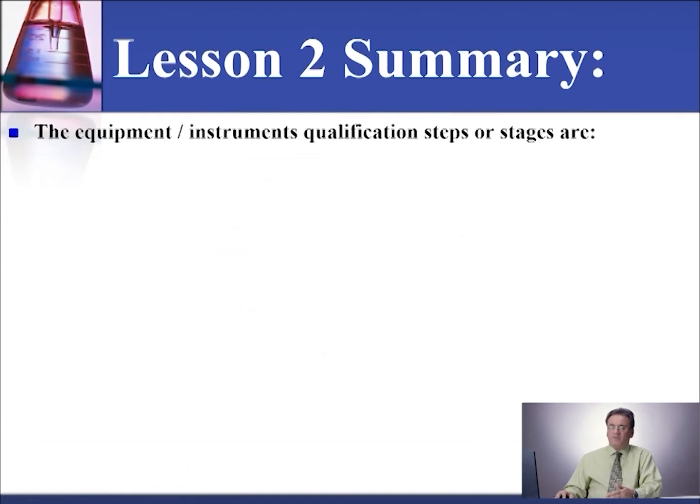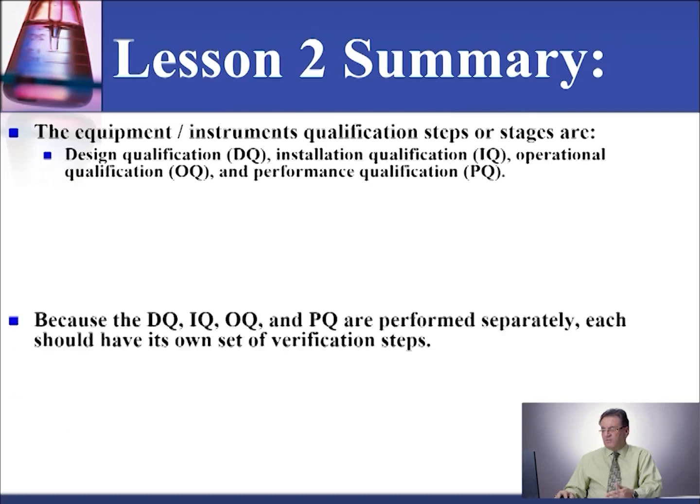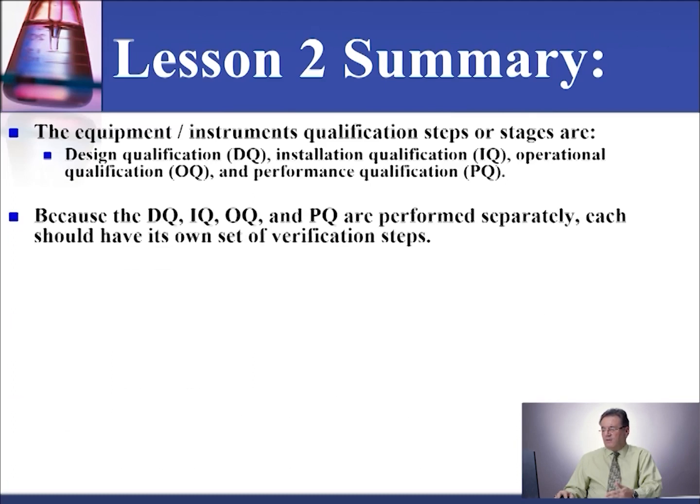Each qualification phase or stage needs to be documented, reviewed, and approved by the medical director or designee. Documents need to be kept for how long? They need to be kept as long as you keep that equipment or instrument, plus 2 more years per CAP, 3 more years per CBAHI for the general lab, and 5 years for a blood bank.